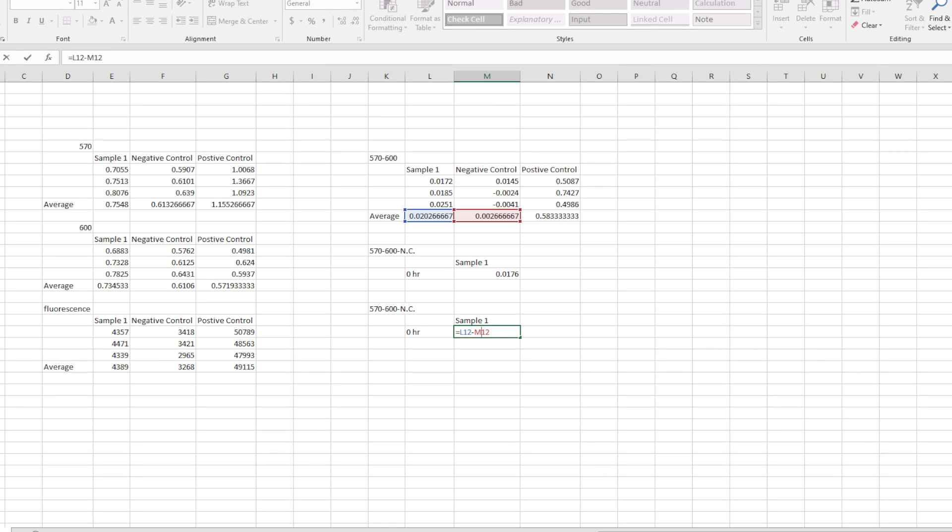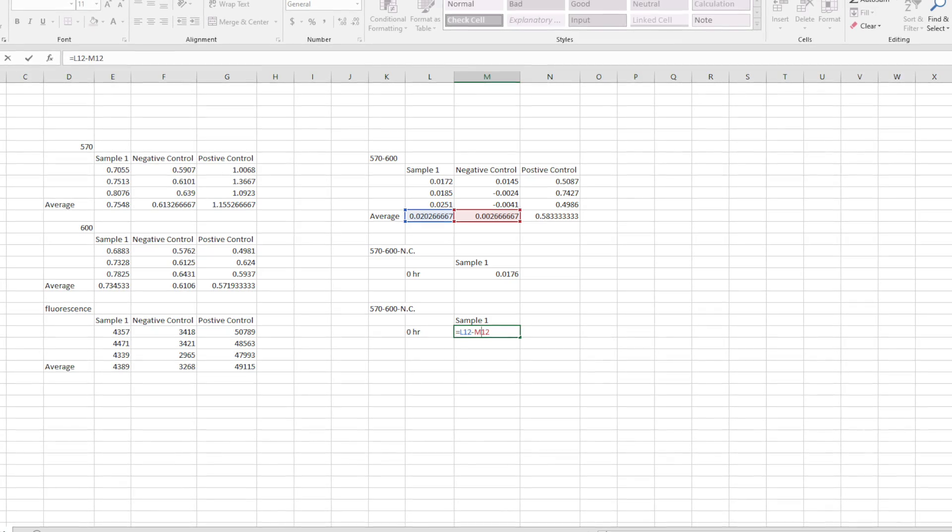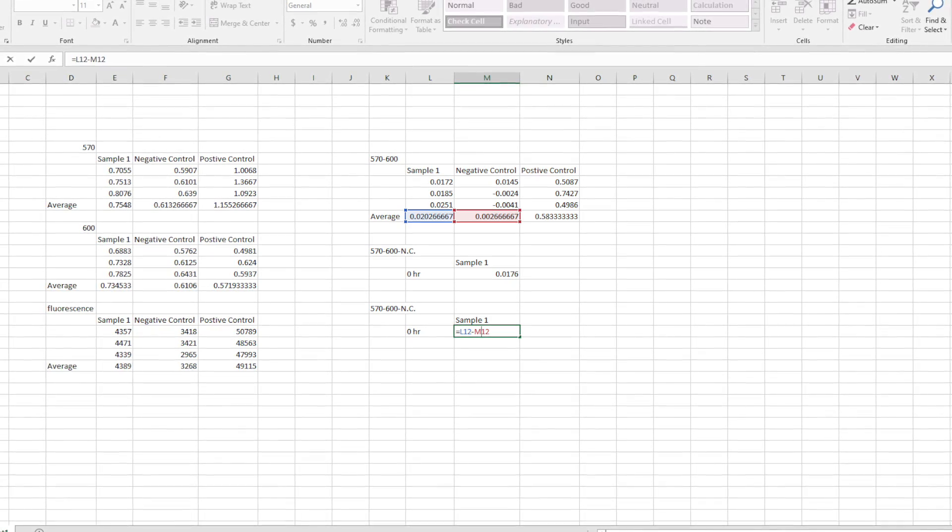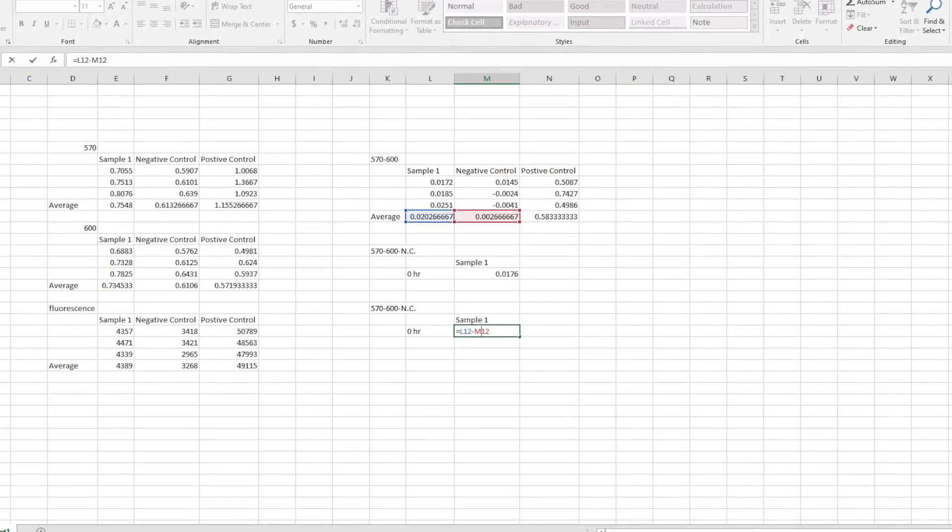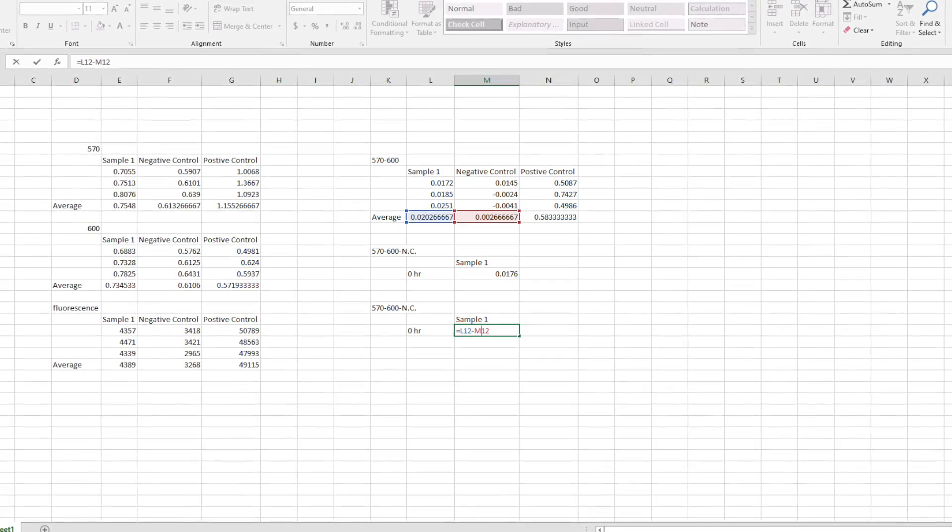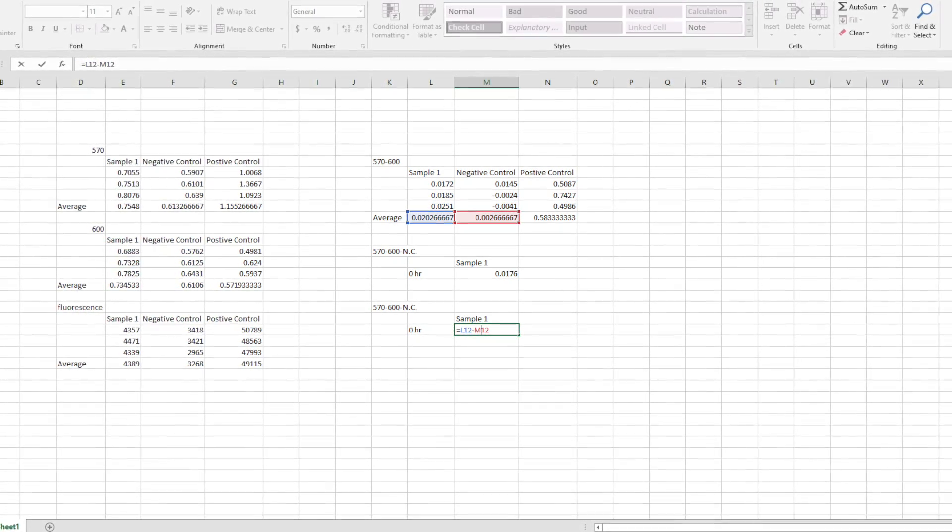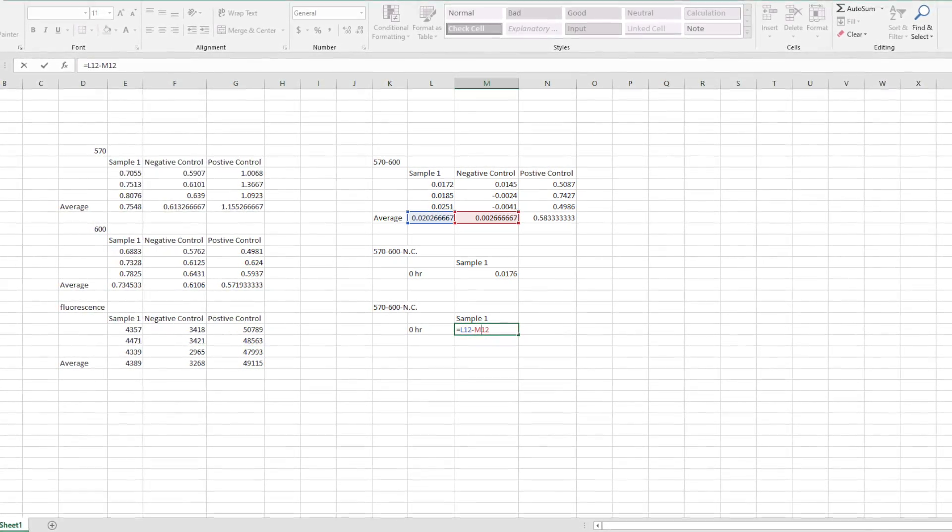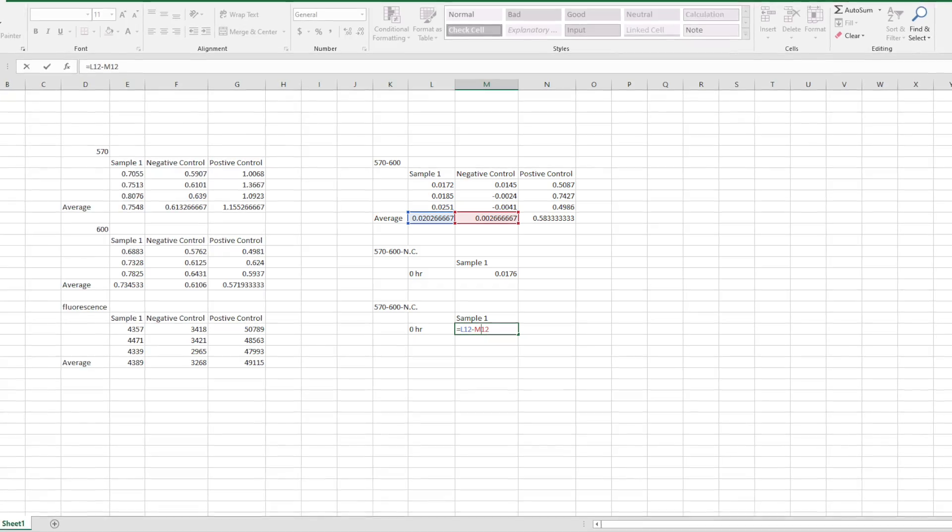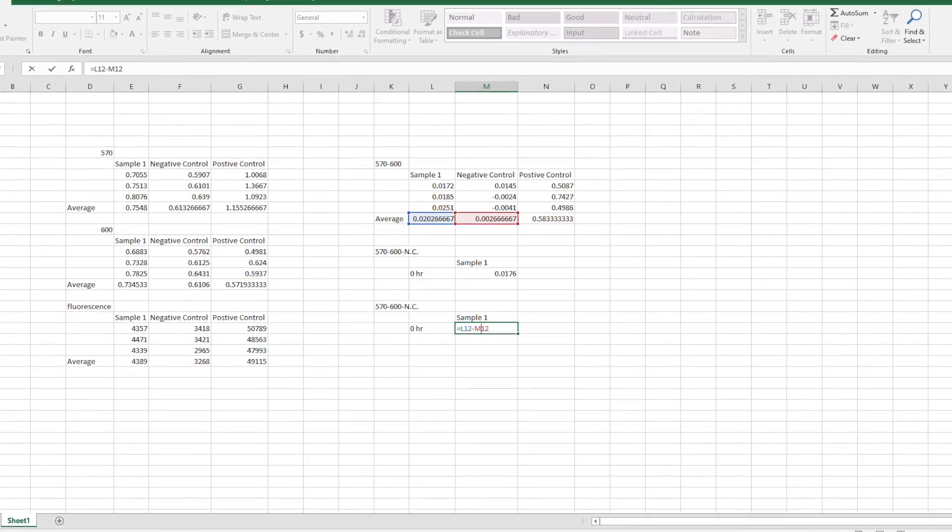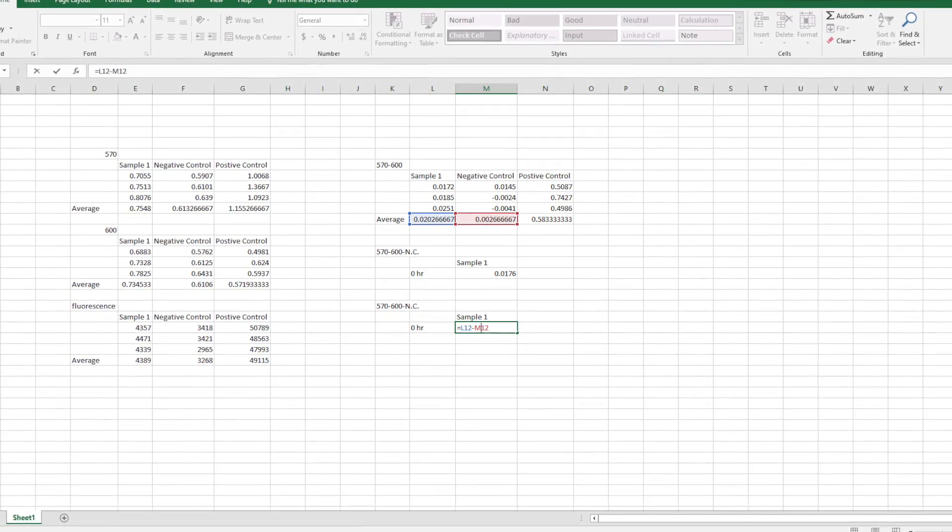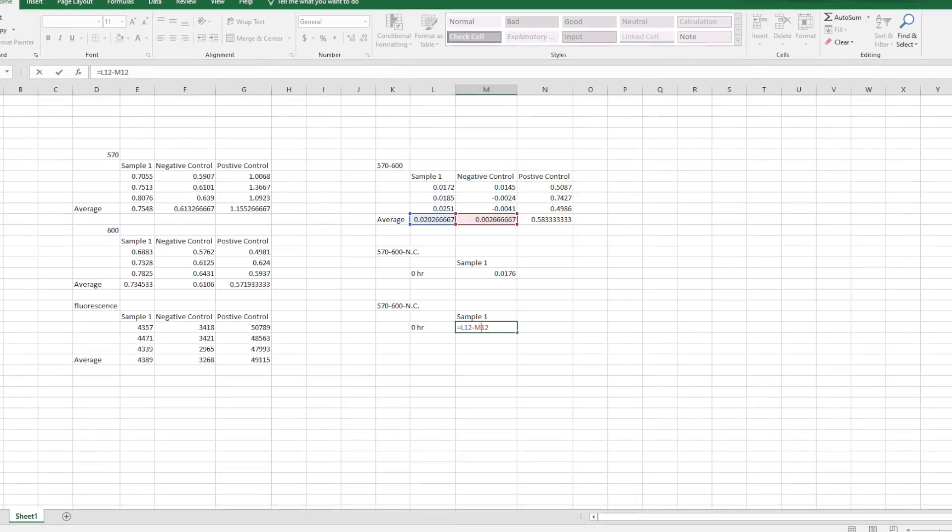Now we've added what's called the 570 minus 600 minus NC or negative control. And so the negative control is the background or just the initial absorbance and you want to take that out so you know how much different your sample is from nothing. How much your cells are actually eating of it.